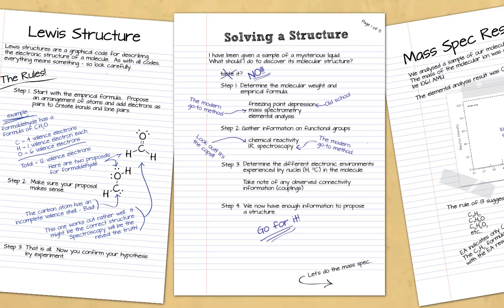However, today we would use mass spectrometry. That will give us, hopefully, the molecular ion and the exact mass of the molecule. Elemental analysis can tell us the percent mass of various elements, and it's very useful for determining how much nitrogen or sulfur or hydrogen or carbon is in a molecule, and it can help confirm an empirical formula that we might propose from the molecular mass.